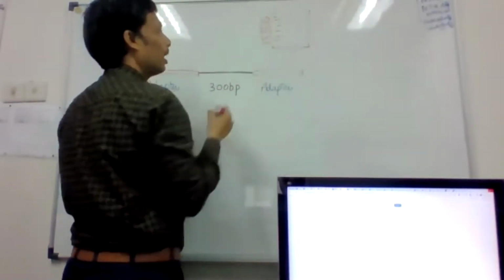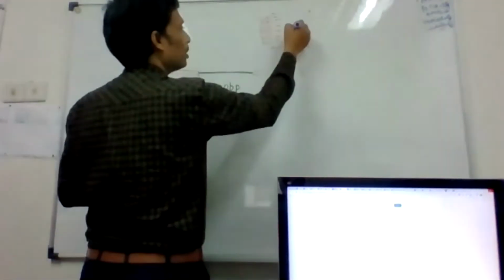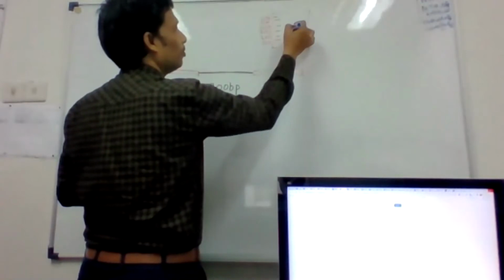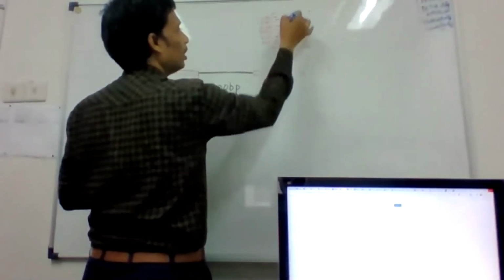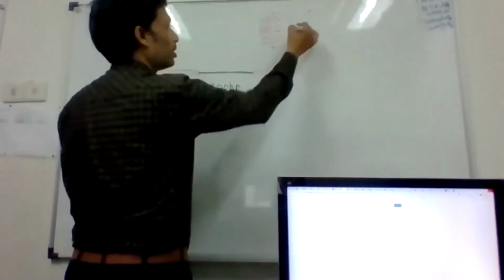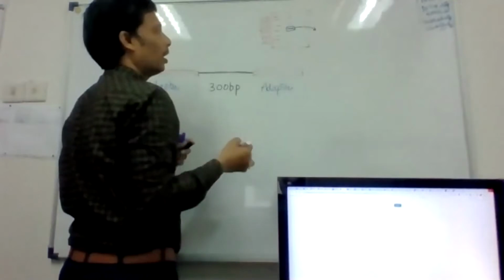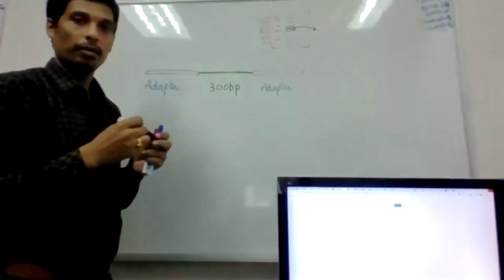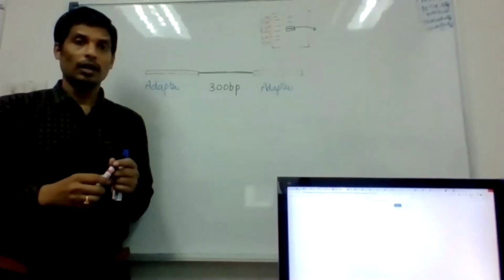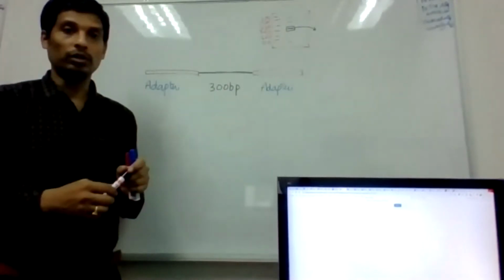You run your sample, and it comes around 300 to 400 somewhere here. If there is any undigested DNA or small DNA, you need to exclude it. So cut this gel and purify, and that will have around 300 base pairs of all the sequences, and to that sequence you add the adapters at both ends.